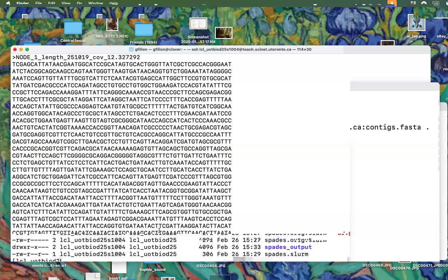So does anybody have a suggestion of what we can do to find what the mystery species is, at least conceptually? BLAST. Of course we use BLAST. We always use BLAST. That's always the same thing.